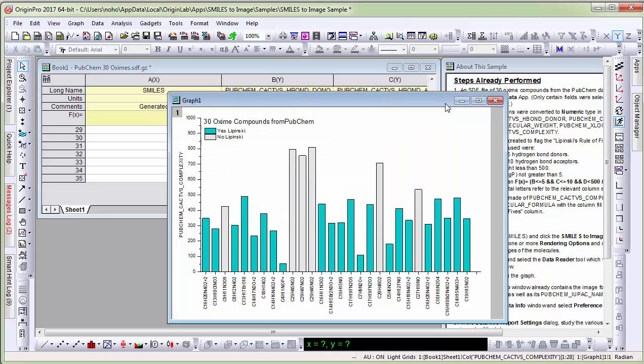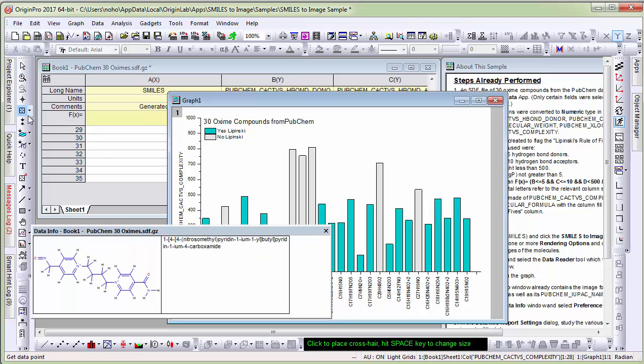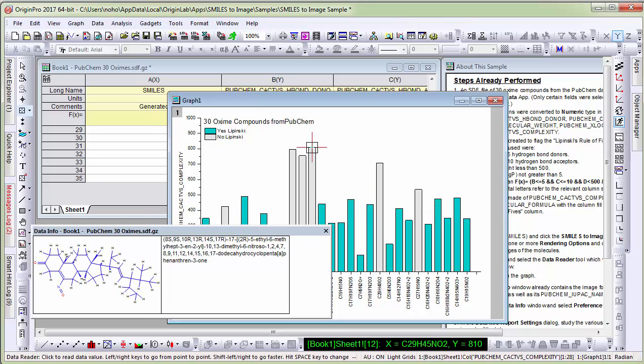Now let me switch to the graph. Origin has a data reader tool. Let me invoke the data reader tool and click on any of the data points.